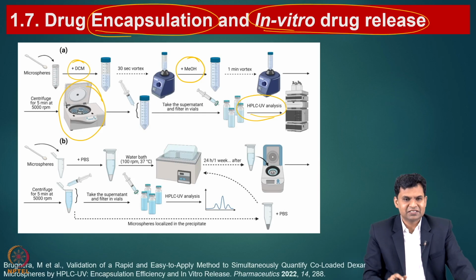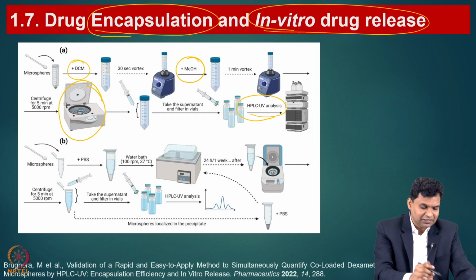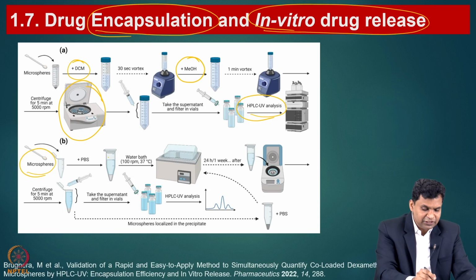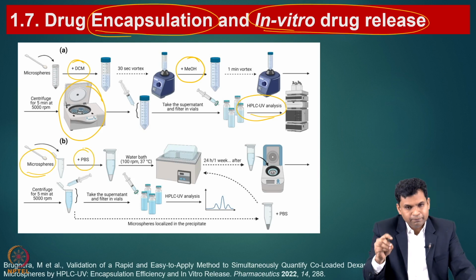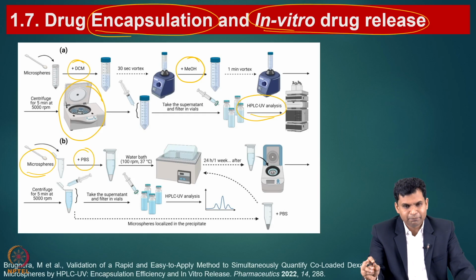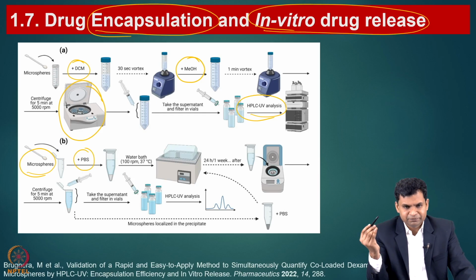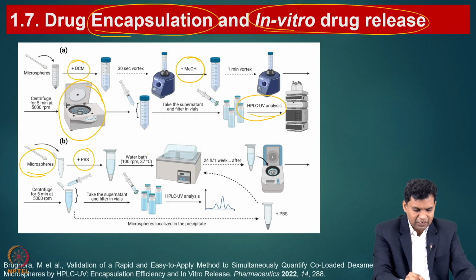And the second one is in vitro drug release. The drug loaded formulation needs to be placed in the required buffer or PBS 7.4 for different time intervals, while maintaining mixing as well as temperature, and we need to collect the samples.